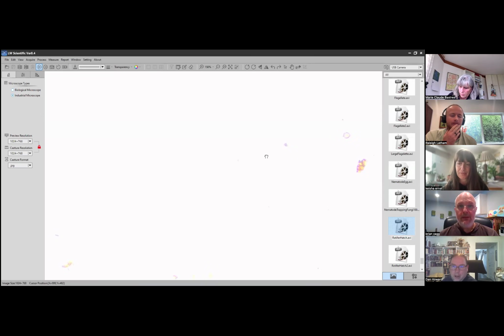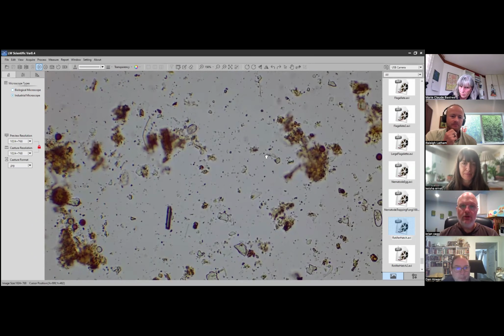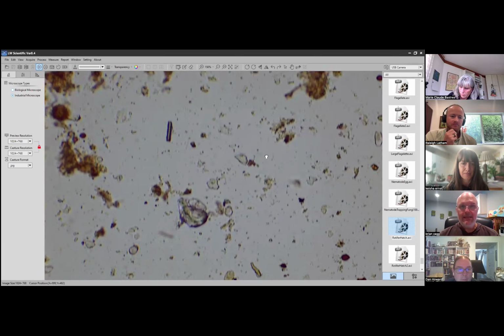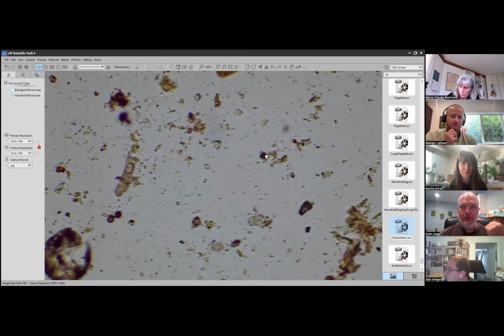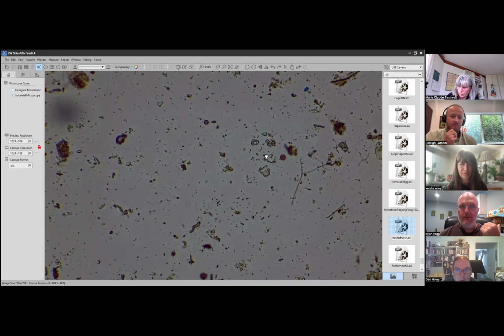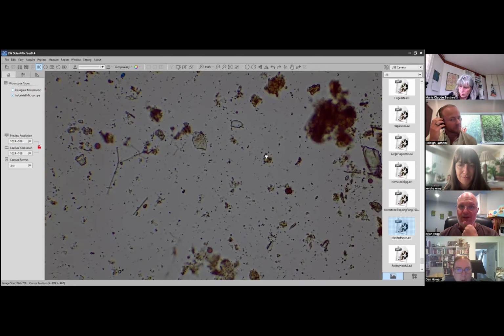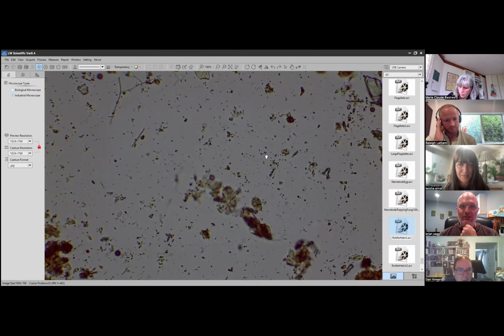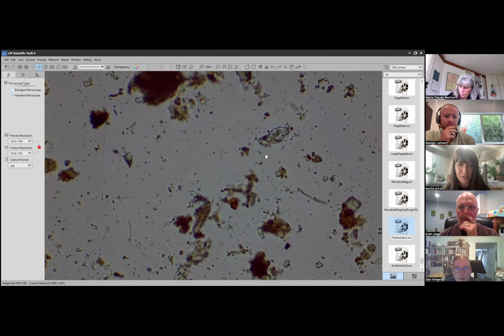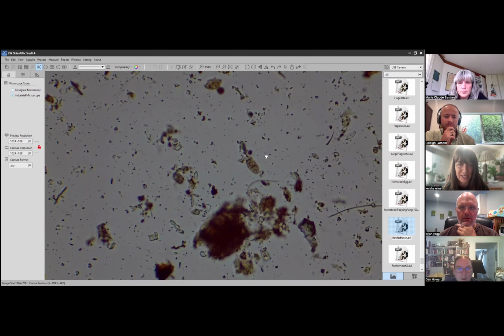Rich asked about naked amoeba as well, how you spot naked amoeba. A lot of times you've got to kind of train your eye. You're looking for kind of like a blob moving. I did see naked amoeba in my vermicompost sample earlier, so if I get a chance, if I find one before the end of the webinar, I'll show it to you guys. They're fun to watch though. They are just super cool as they ooze through the soil. Really good work, Dan. There's so much fungi here. There's so many different sizes and shapes and colors of testate amoeba.